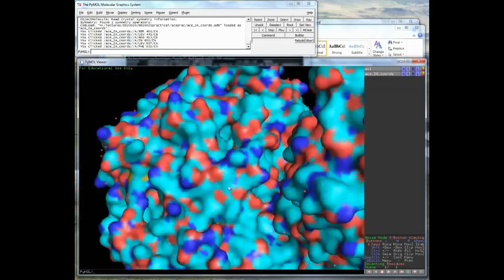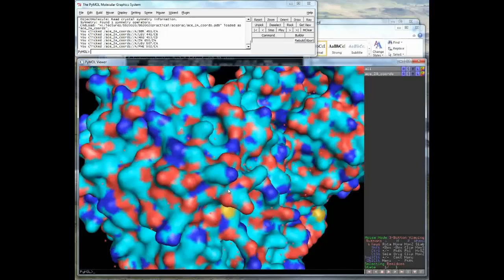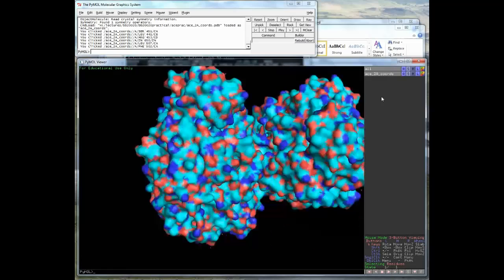I have made a picture like that, but I think I'm not going to be able to just do it so simply, and I probably need to check much more carefully where the ligand was and stuff. But you can also see inside surfaces. It's just you need to plan it a bit more carefully.